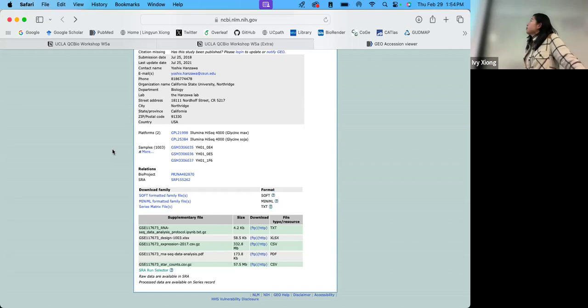I tried to go through 200 samples in this one, and I think it took me a couple of days to make sure I got all of them downloaded successfully. It's not that you can't automate the download process. It's because the download takes so long, because each of them is 2-3 gigabytes, and the connection is not always stable.